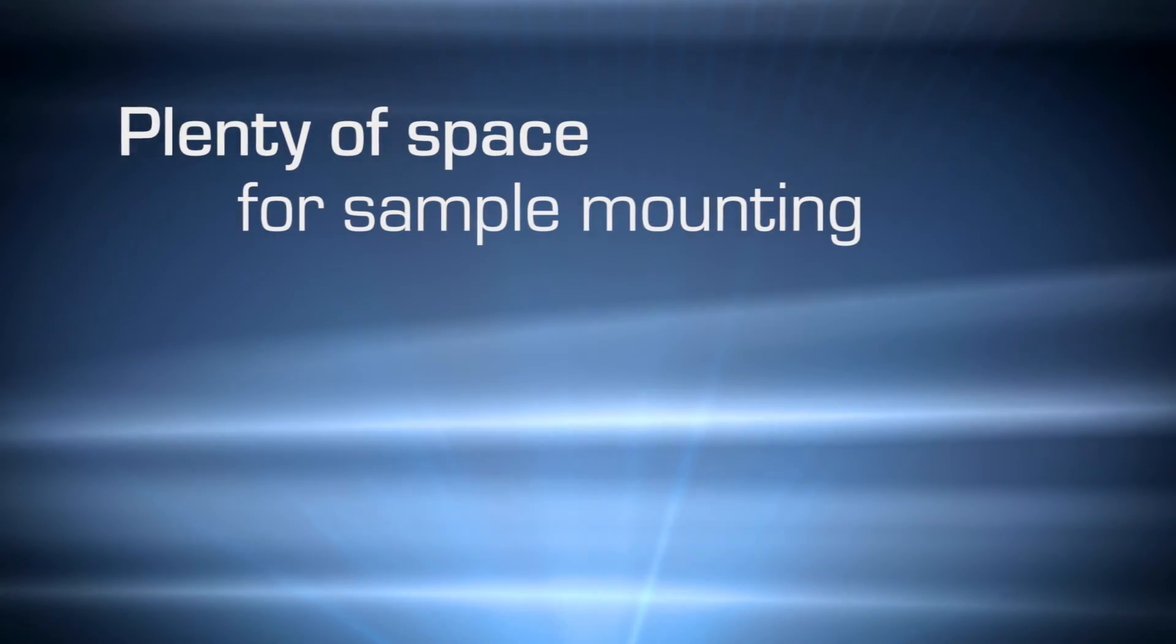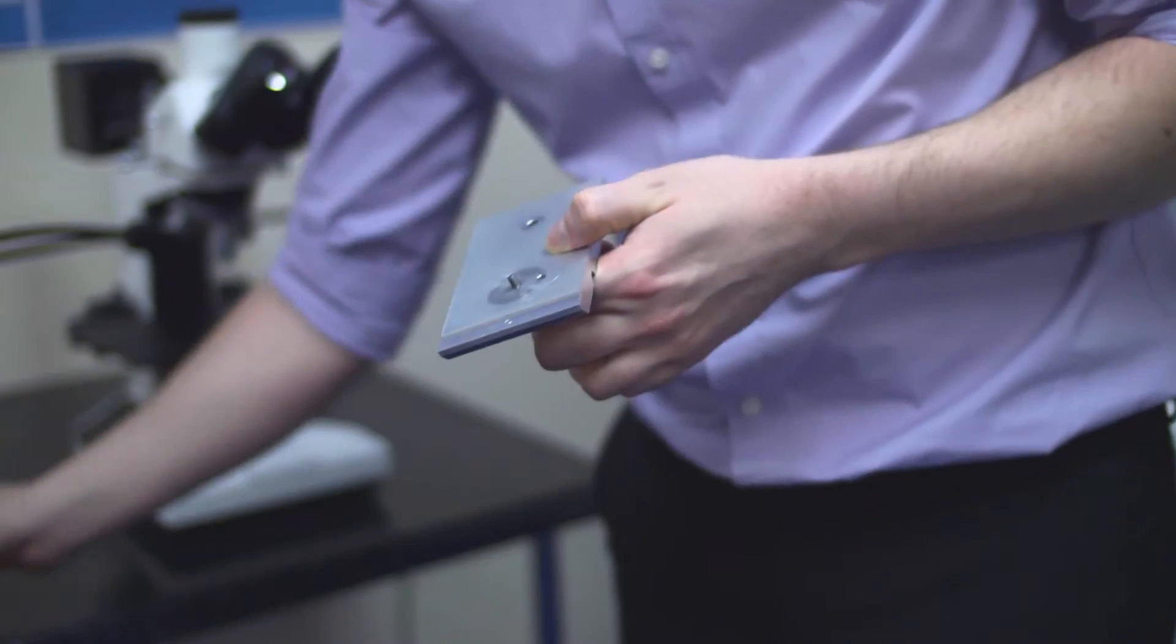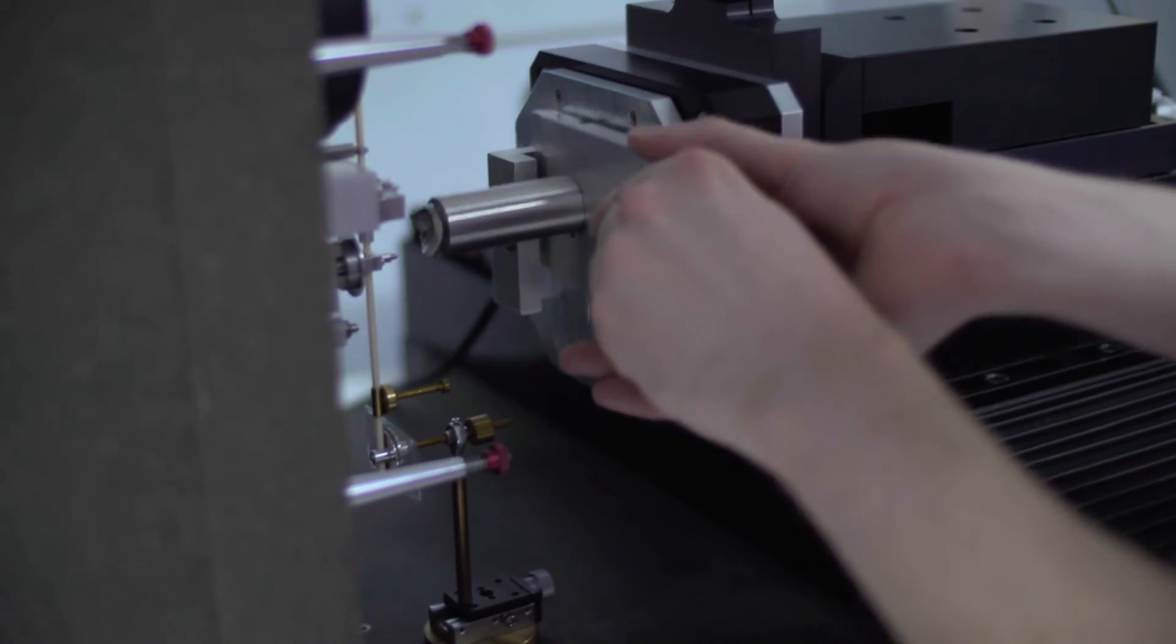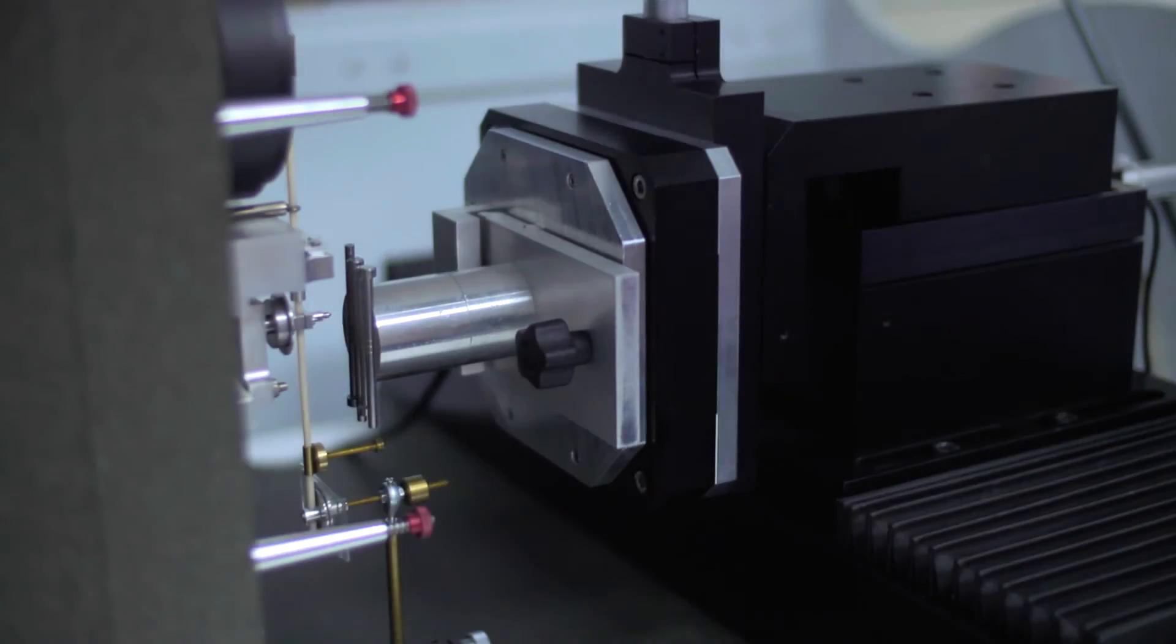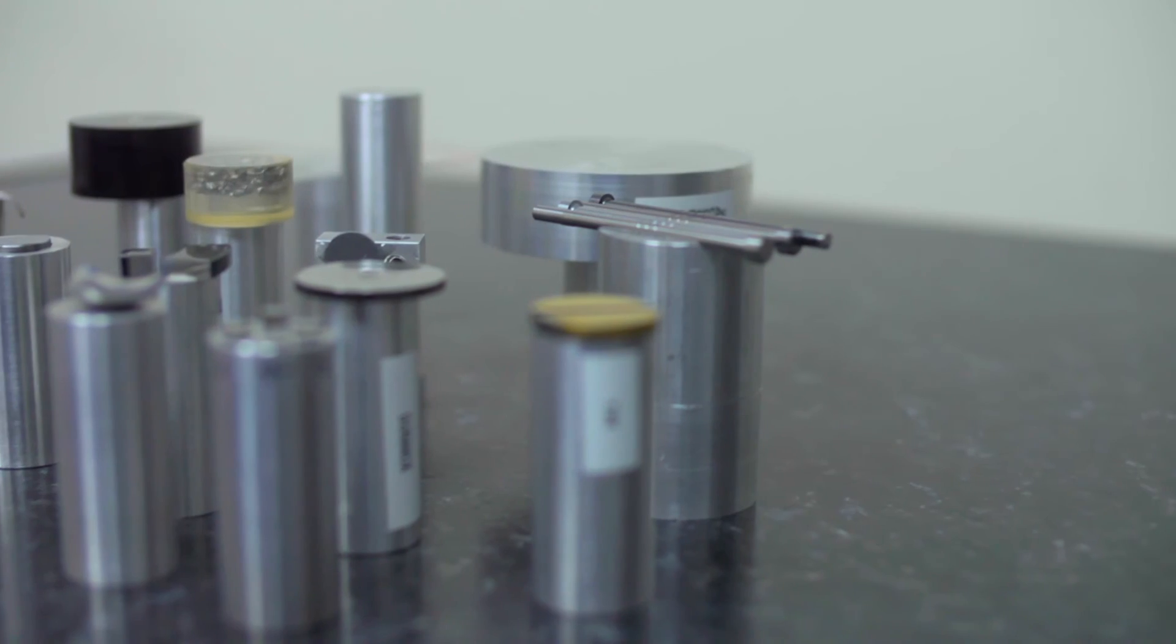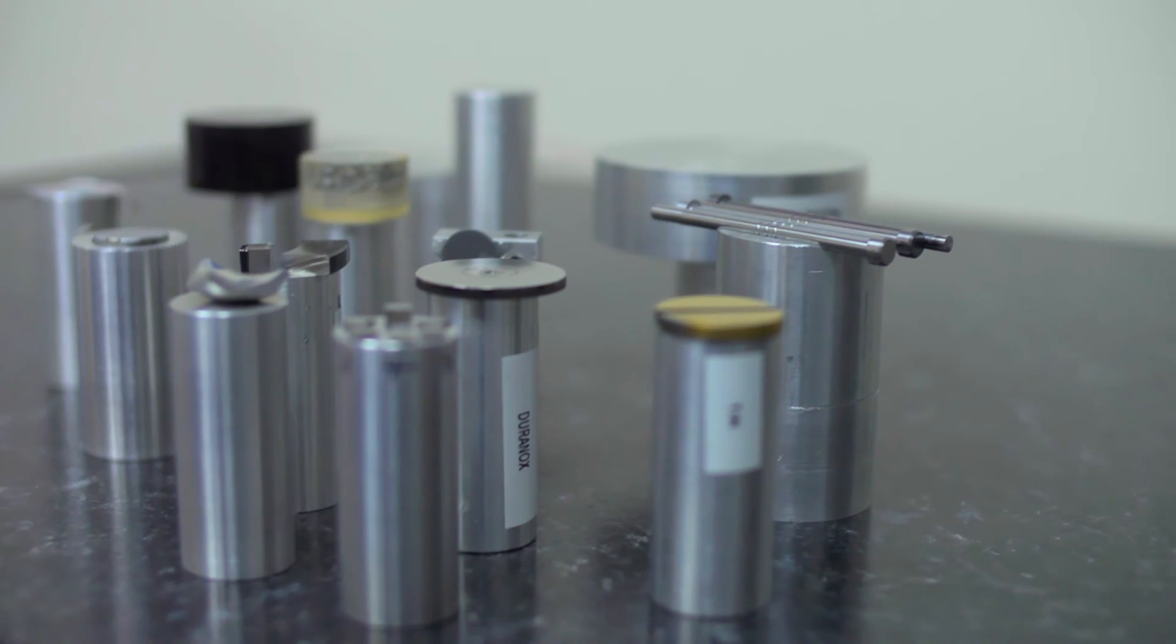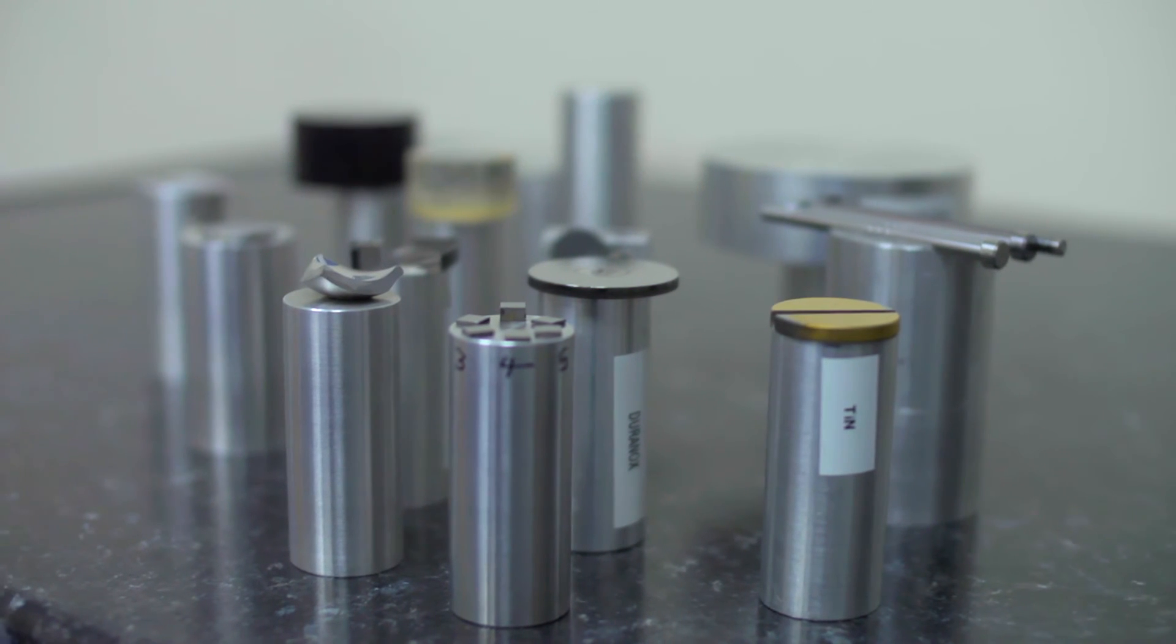One key advantage of the NanoTest systems is its open-platform design. This allows plenty of space for sample mounting, which means large or unusually shaped samples can be tested. In addition, multiple samples can be tested within one experiment schedule, without user intervention.